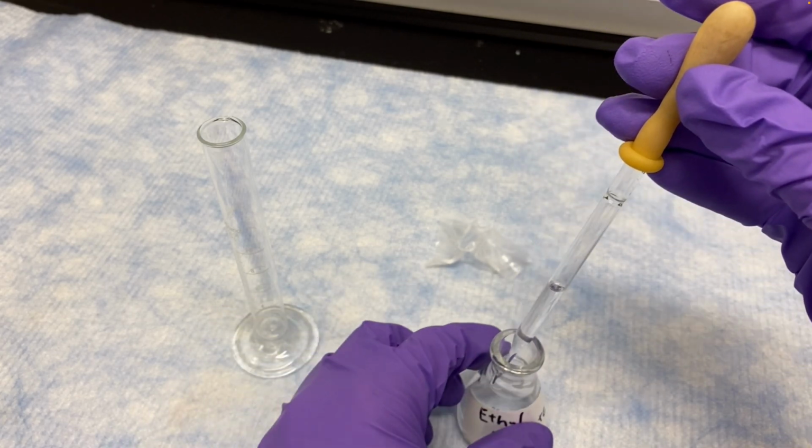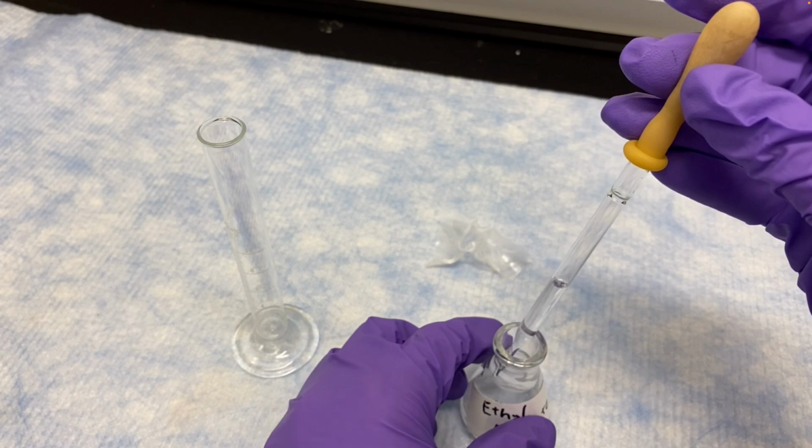In general, when you transfer a liquid from one container to another using a Pasteur pipette like this, you want to try to keep the two containers as close as possible to each other. The further they are, the more chance that some liquid will dribble out of the Pasteur pipette as you carry it across.